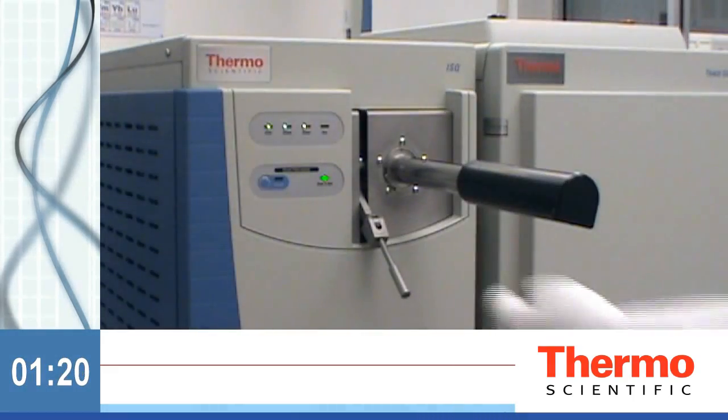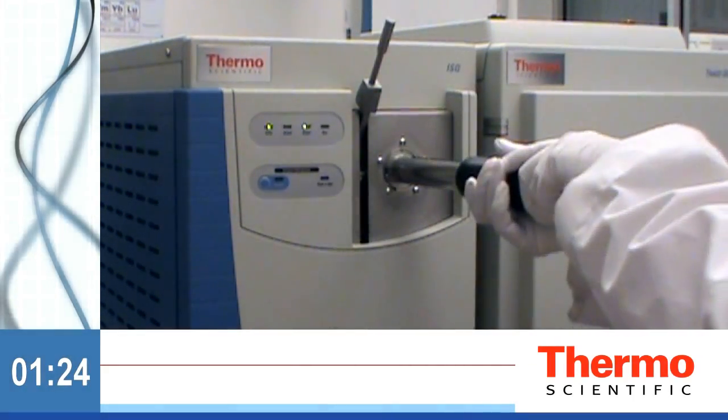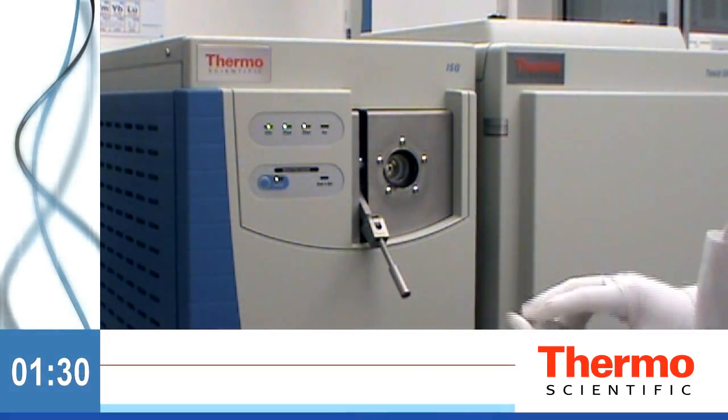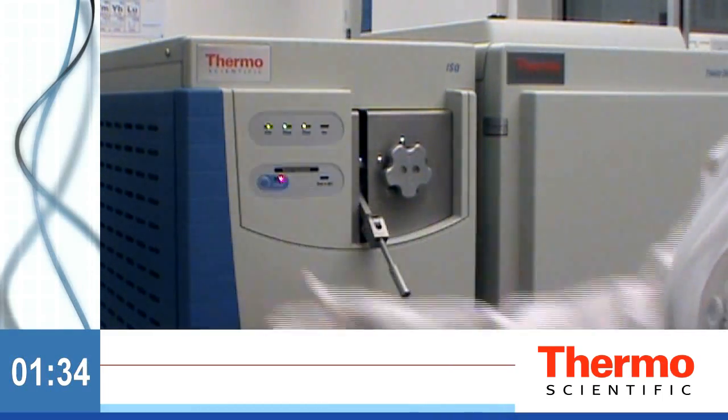When the ready-to-open light goes green, open the valve, insert the tool, and install the ExtractaBrite ion source. Retract the tool, close the valve, and replace the plug.